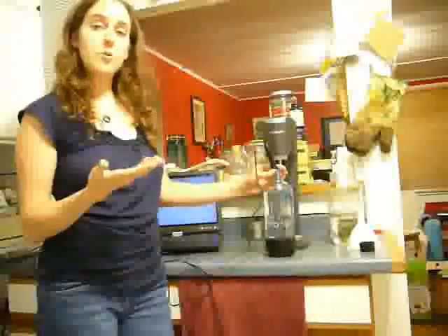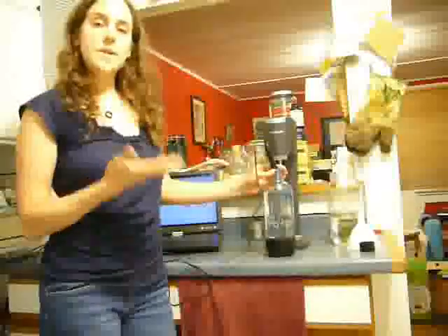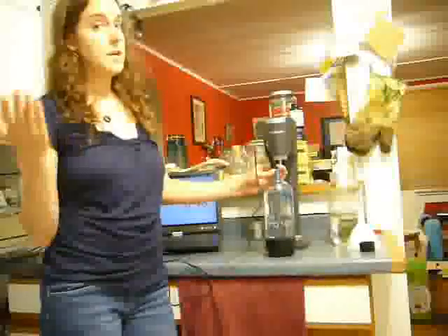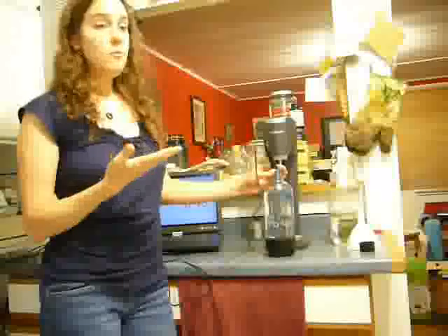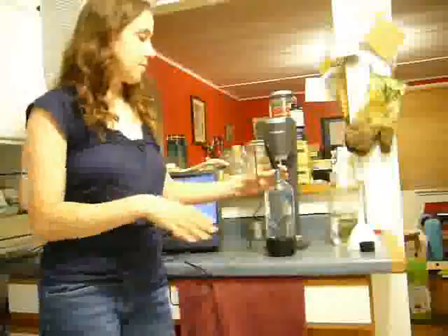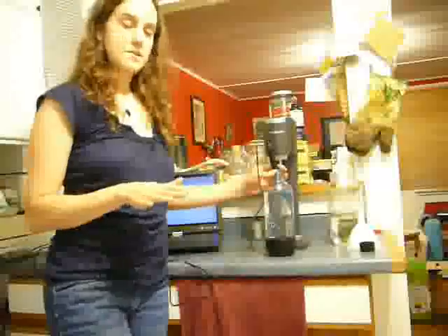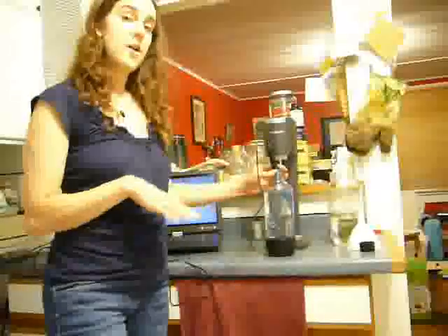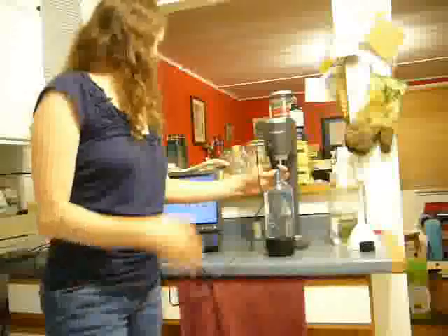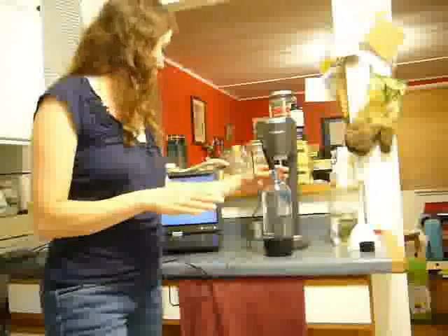Now, in this experiment we're going to be doing, the independent variable, the variable that I am changing, is the carbon dioxide. The dependent variable, or the variable that's going to change because of what I'm doing, is hopefully, if we're correct, the pH of the water. Now, we want to keep everything else the same, so we're going to be using the same water, same setup, same bottle, and not change anything else, because we don't want anything else influencing our results. I'm just going to give this a minute to stabilize, because we want to make sure we have an accurate reading.